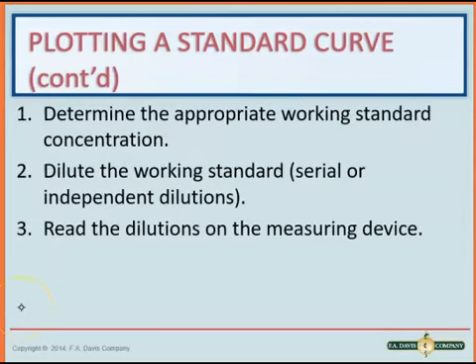When you're plotting or establishing a standard curve at the beginning, you want to use the appropriate working standard concentrations. Again, you've got to have enough standards to establish a line. So you have to have at least 3 standards, right? Because we have to have 3 points to even create a line or a curve.